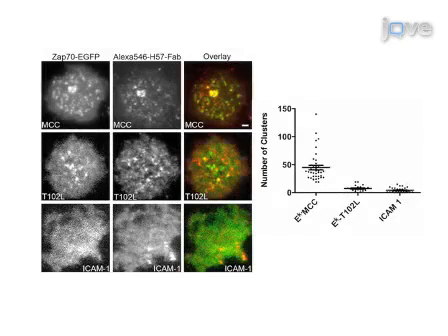Analysis of the resulting images reveals signaling takes place in T-cell receptor microclusters. The main advantage of TIRF microscopy over conventional confocal microscopy is that you get better resolution such that signaling clusters or signaling complexes such as TCR microclusters are easily visualized.